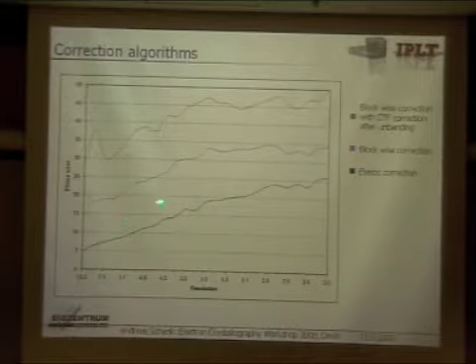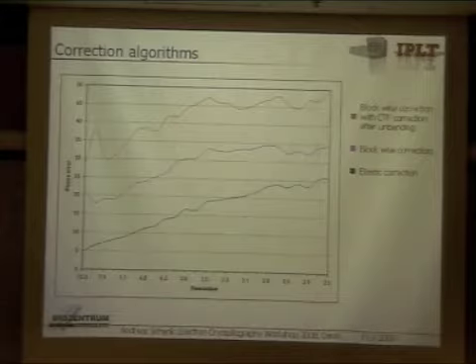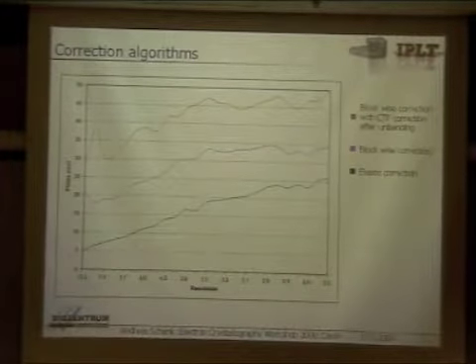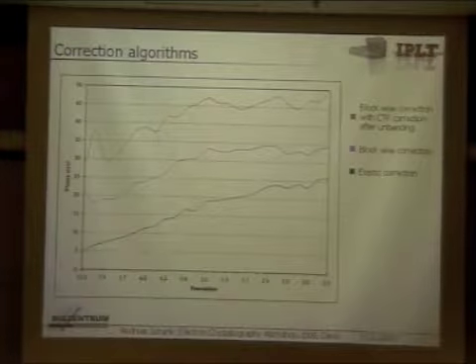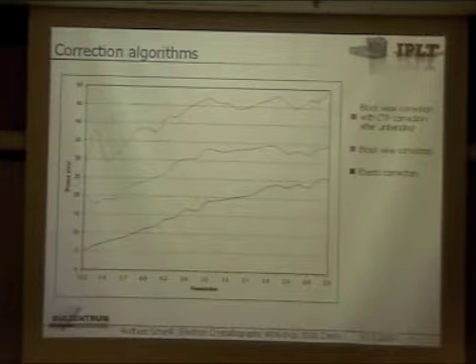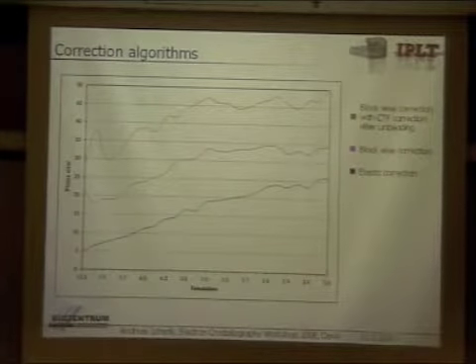And we now really want to try to use that algorithm with the CTF correction before the distortion correction on a whole data set and see what will happen. If we can see a difference in the average, in the final merged projection, then we can quantify it also in experimental data, not just in simulation.